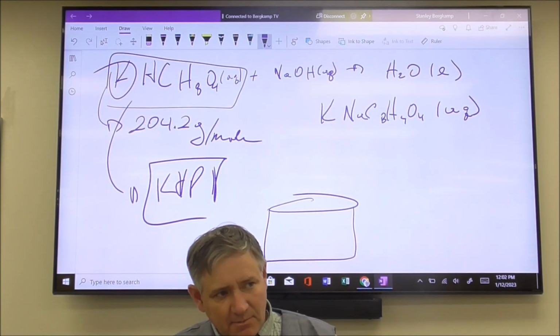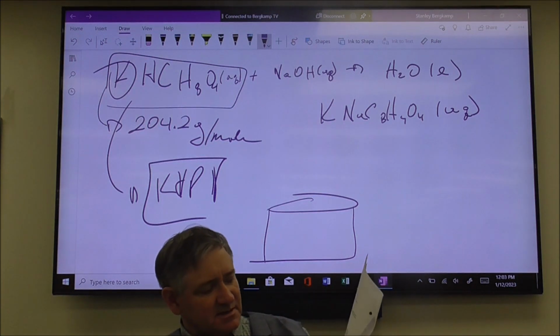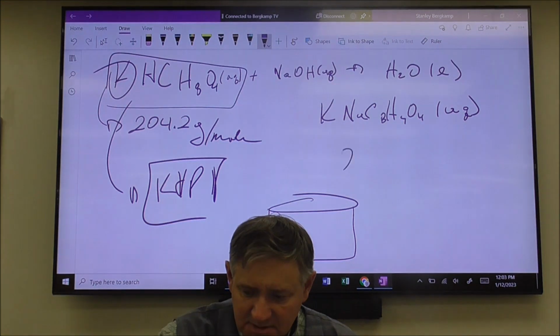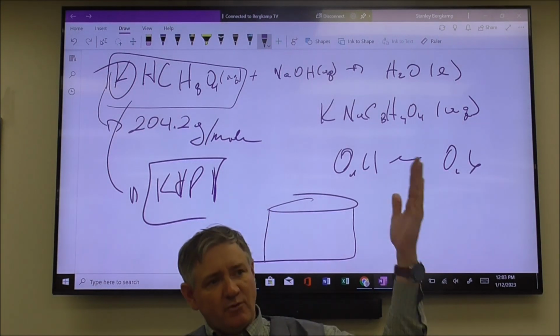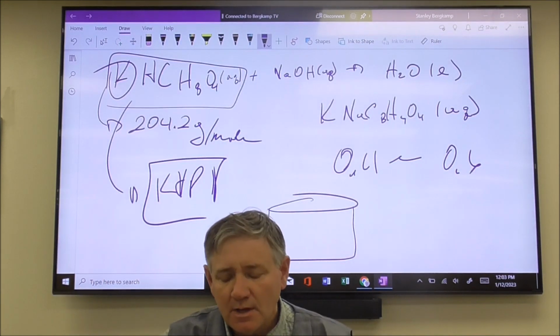It's not a lot of carbonic acid, but it can be enough to alter our results with the precision that we're going to have. So you've already done step one. Now you're going to get 3 different samples of KHP, somewhere between 0.4 and 0.6 grams. Maybe one at 0.4, one about 0.5, one about 0.6, okay? There are 3 different samples.